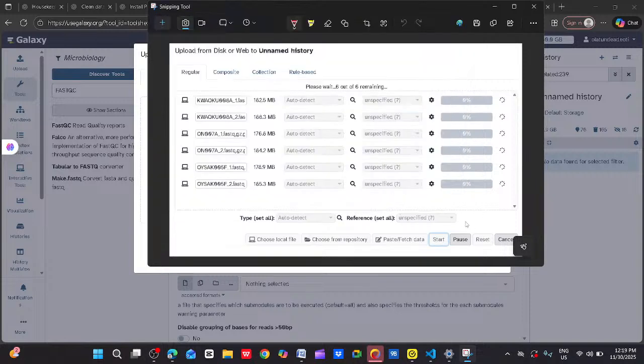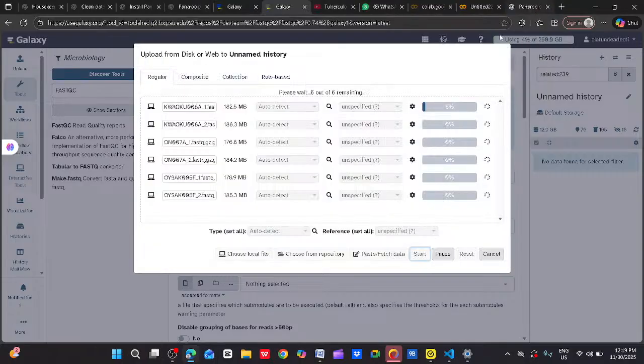So I think this has been stored. So you can see the progress. Immediately it is completed, it will move to this panel. It will move as soon as it reaches 100%. It's going to move to this place. So that's why you need to monitor the progress here.